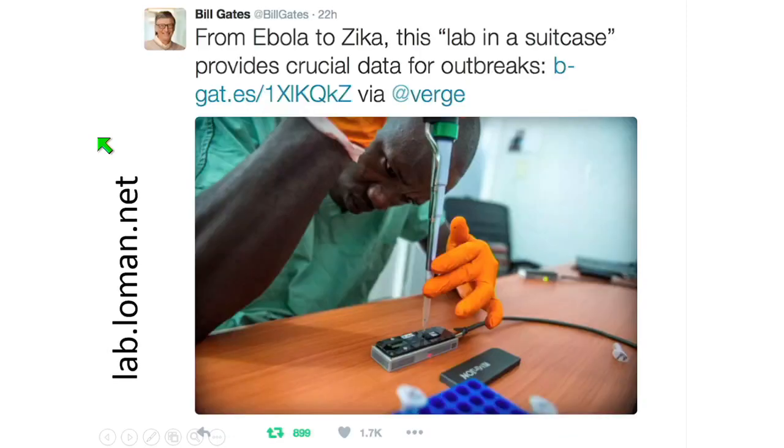Okay, so that's the technical bit over, and I want to talk about a case study, which I hope will be interesting. And this is what's been taking up a lot of my group's time and my time for the last year and a half, which was the Ebola outbreak. I really just put this picture up here because it's from a personal hero, Bill Gates, tweeting our work. Really, I'm going to talk about how we've used the Oxford Nanopore MinION to do Ebola sequencing in real time.